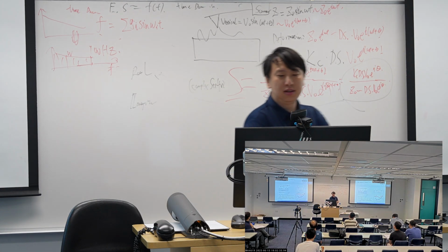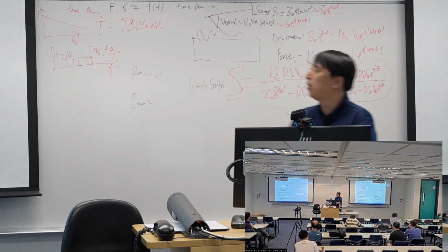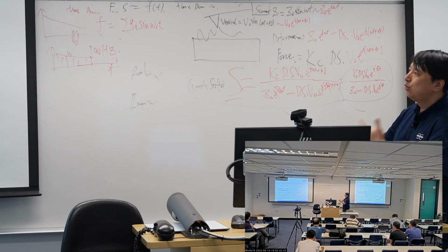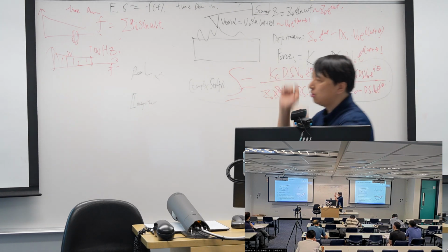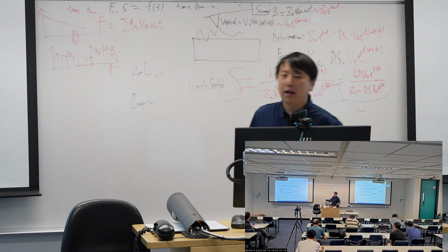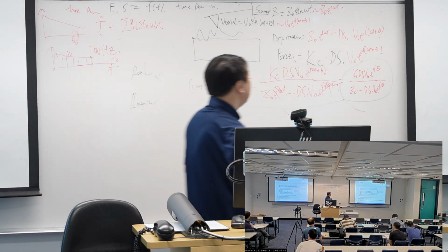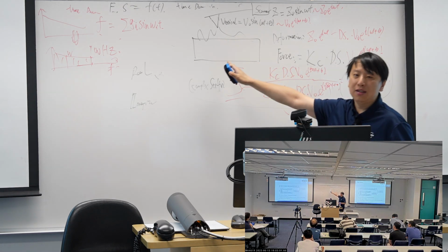So that's the end of the story about the theoretical part. We need to do calibration first, and then leave the calculation to the software. Now, how do we do it? We do it similarly to what we explained yesterday.